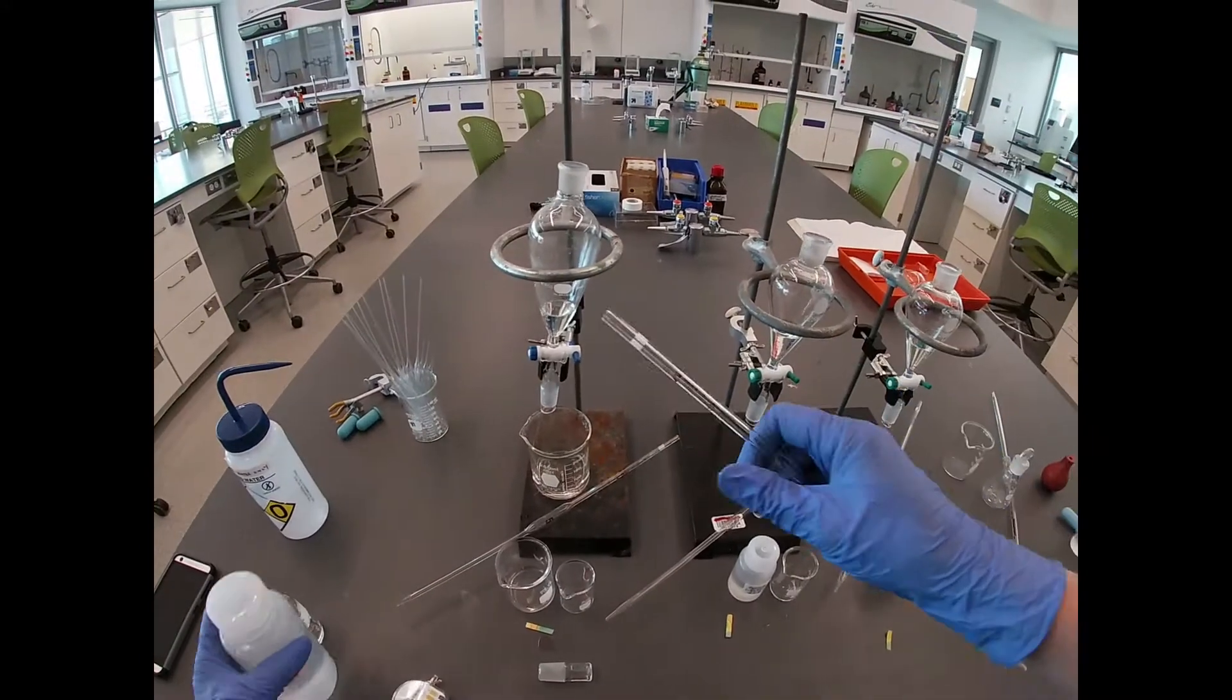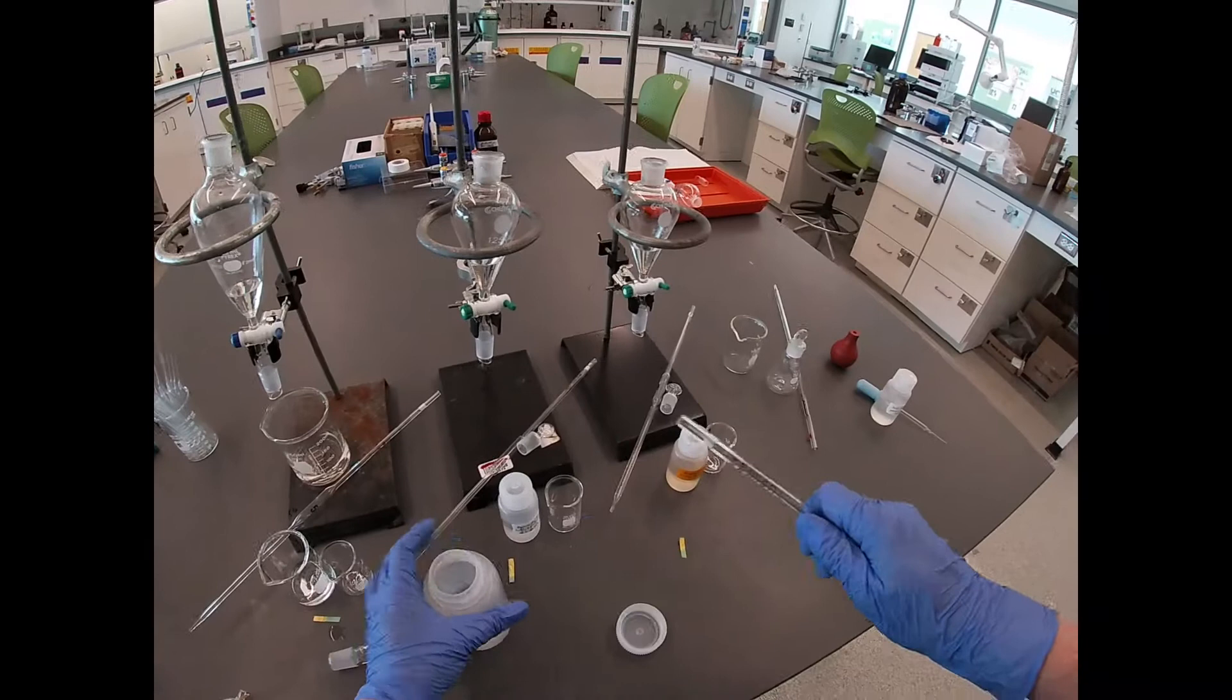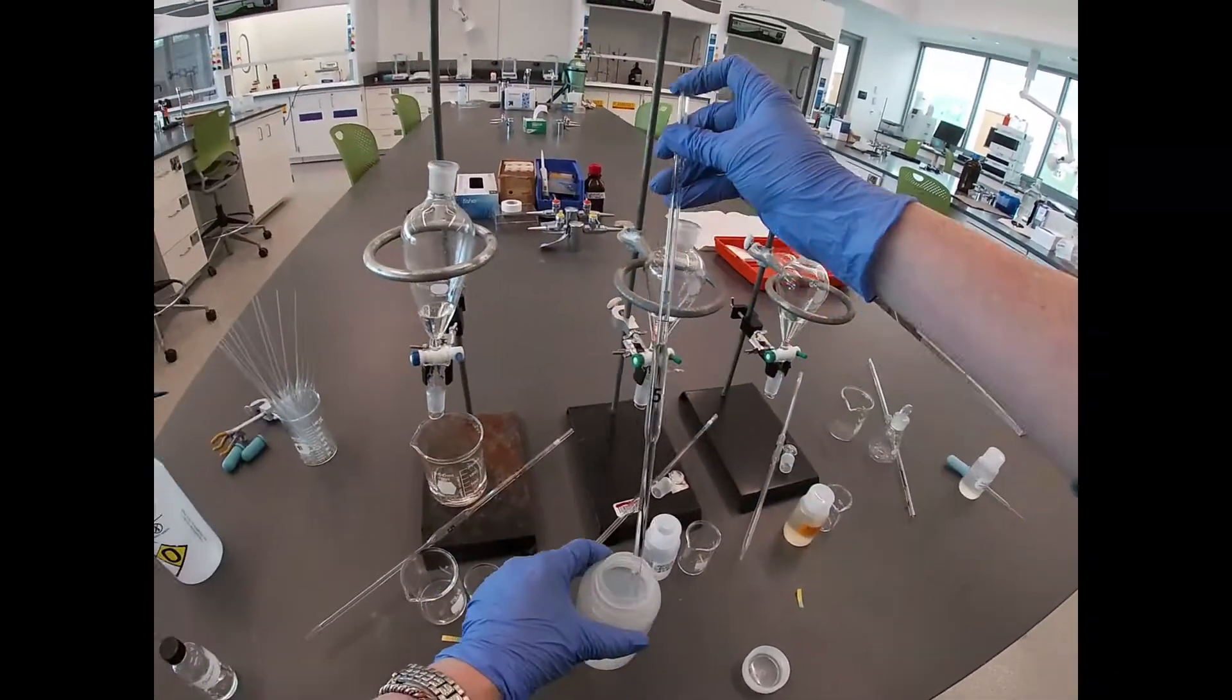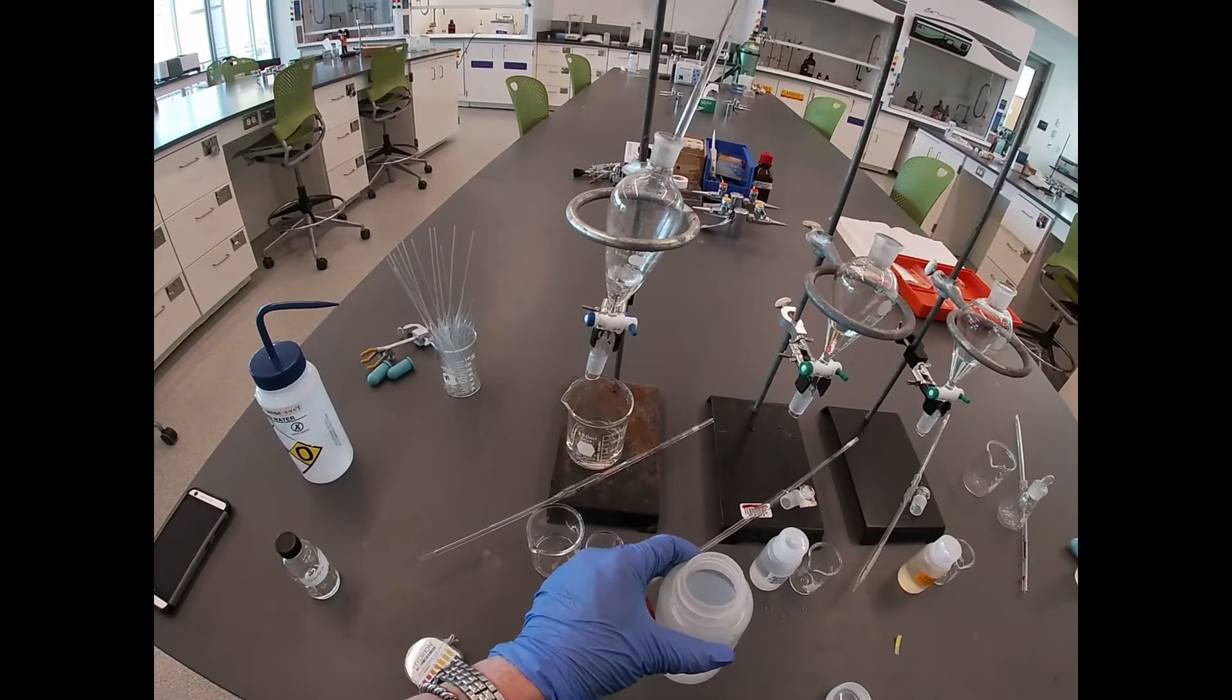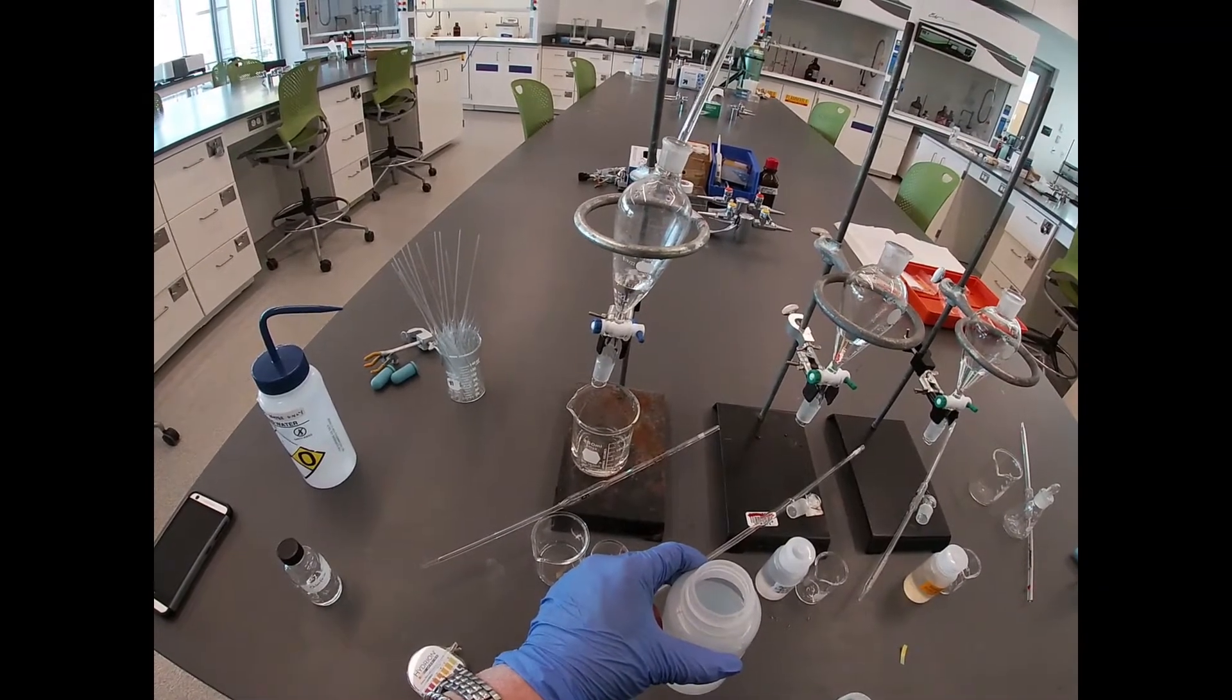We're going to extract into five milliliters of our sulfuric acid. The sulfuric acid is less dense than the chloroform, so it's going to remain on the top.